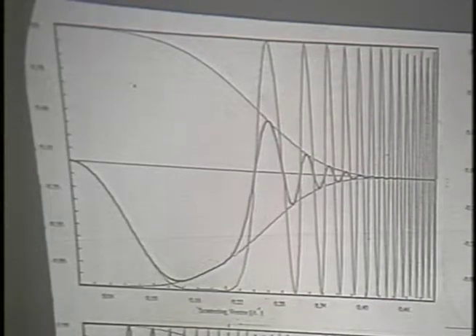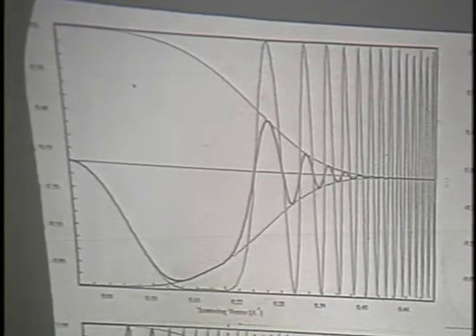It's not the focus that most of you would choose to use for imaging large structures, because it doesn't produce good phase contrast for large features in the image. But for when we're trying to get resolutions in the range of 3 to 5 angstroms, it's normally the optimal focus.